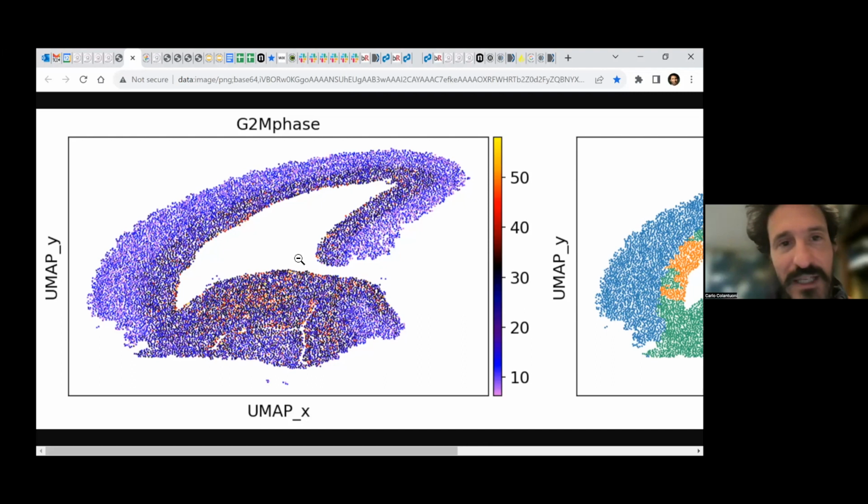I'll send some links to the Slack channel, and we can discuss other things in this space that you can explore in the things we already have up. And as Alex and I make more views of his data, we'll make them available for people to explore.